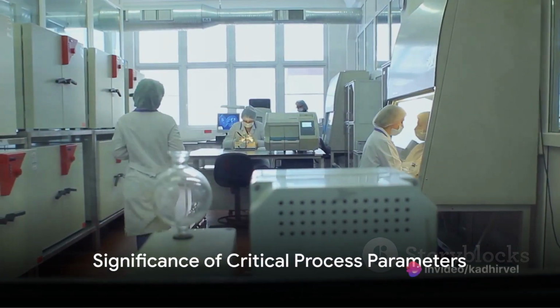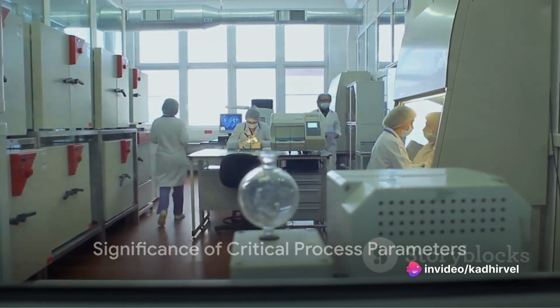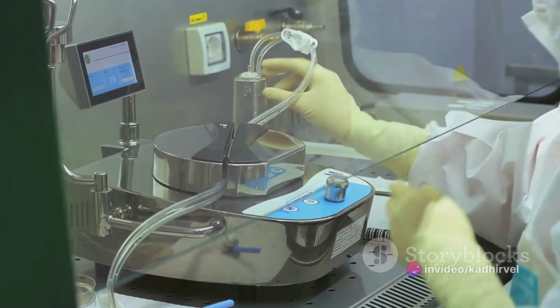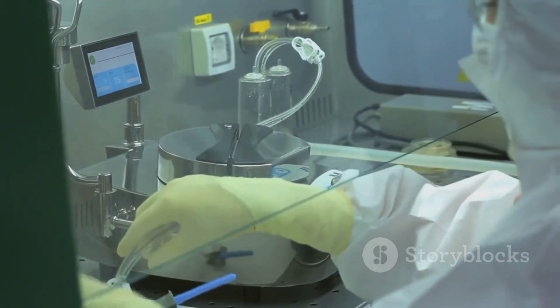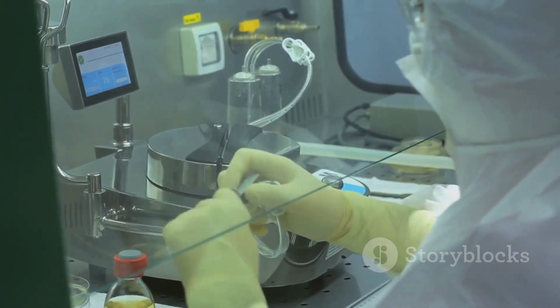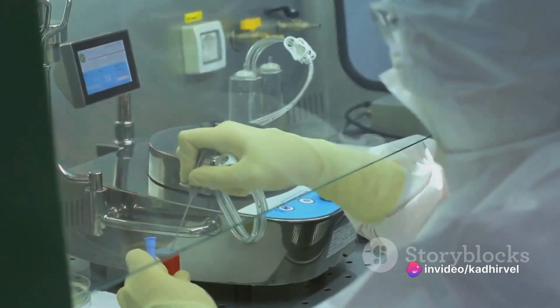Ever pondered the significance of critical process parameters in monoclonal antibody manufacturing? These parameters are the cornerstone of ensuring product quality and consistency, particularly in Anion Exchange Chromatography, or AEC.